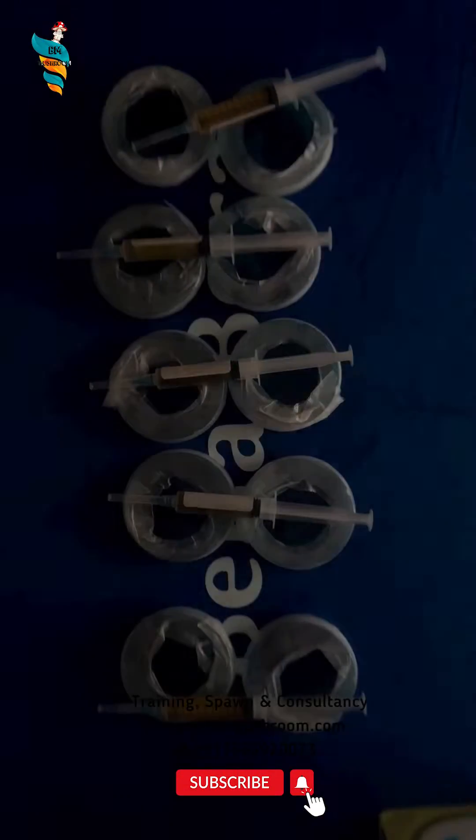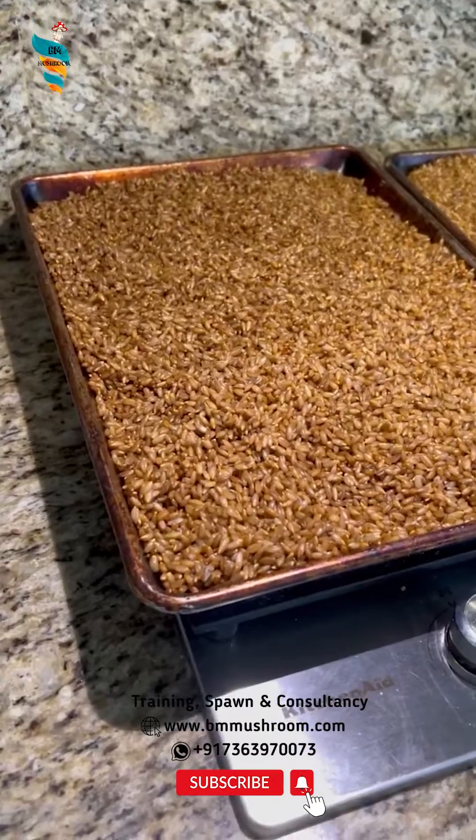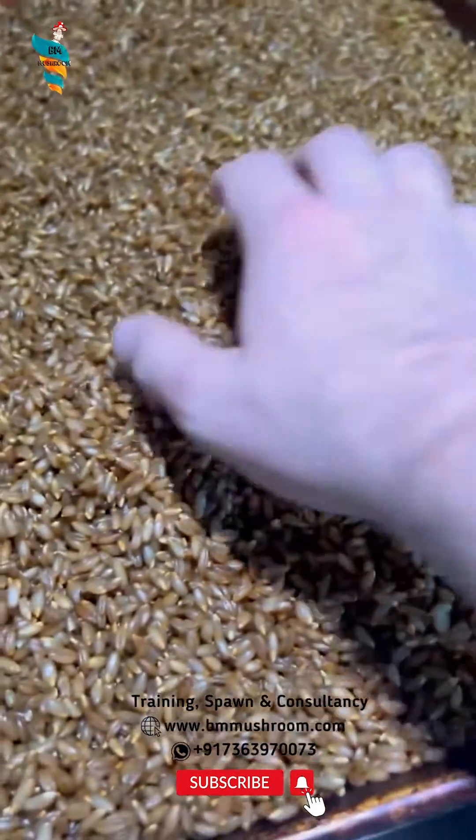You can make grain spawn in 4 easy steps. Step 1: Rinse and clean the grains, then soak in water for 12 to 24 hours.